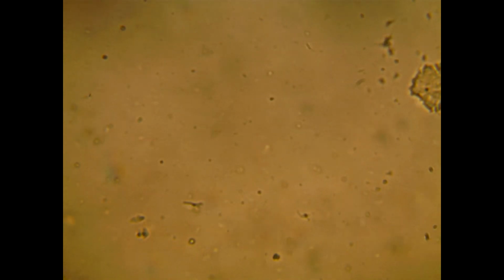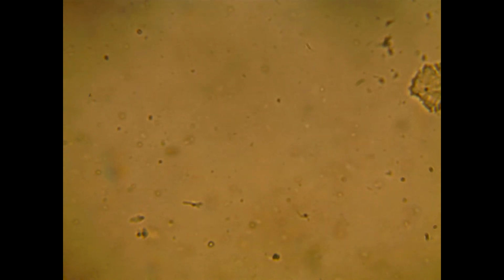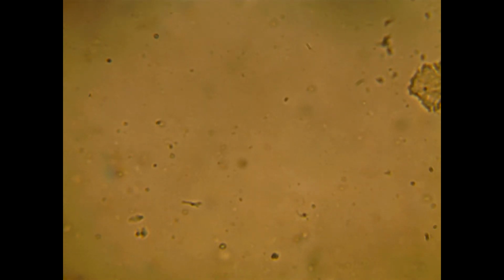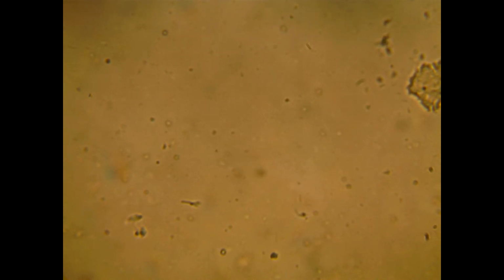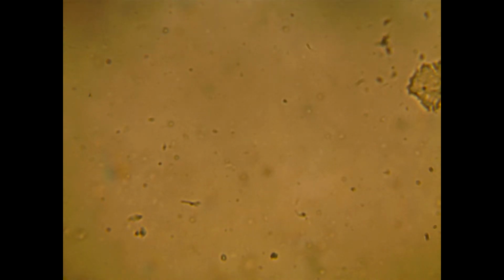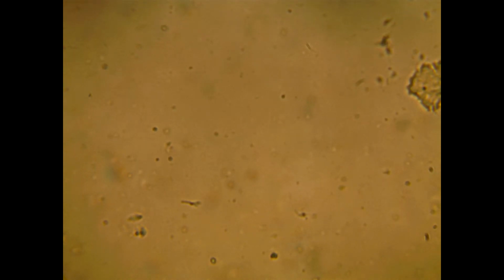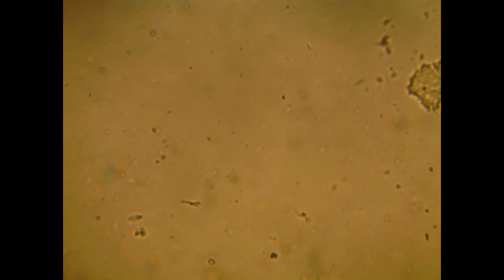Okay, so this is that same sample, and I've moved the slide. I've actually adjusted the slide to look at a different part of the sample. And again, when you see this movement underneath, this flow-like, that's actually the water that's moving, because I'm either touching the slide with the very tip of the lens, because you get it very, very close. Look, okay, you see all those guys.